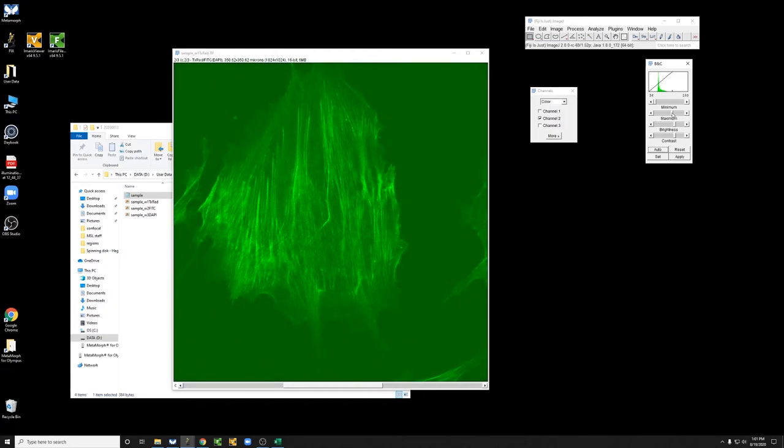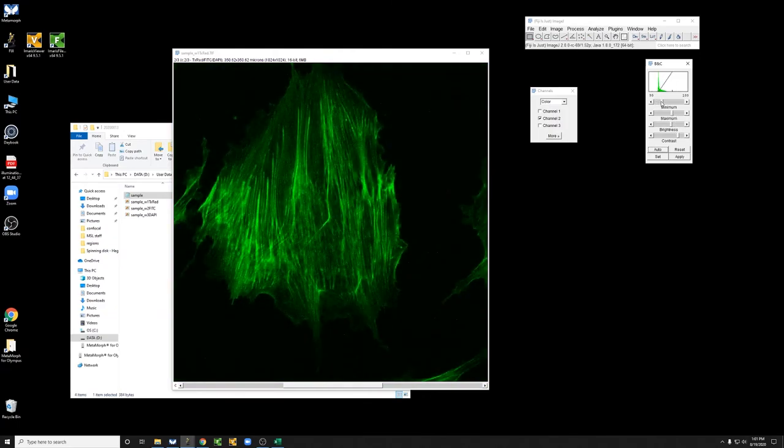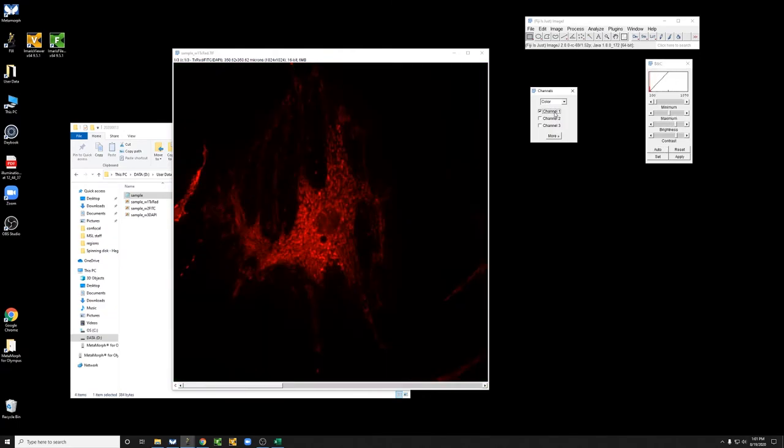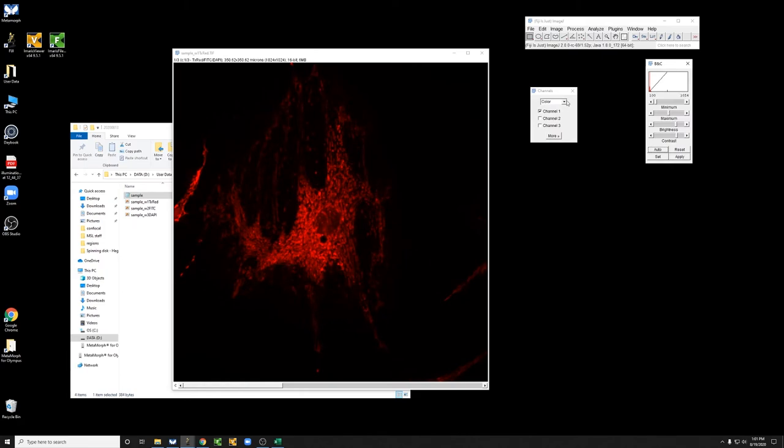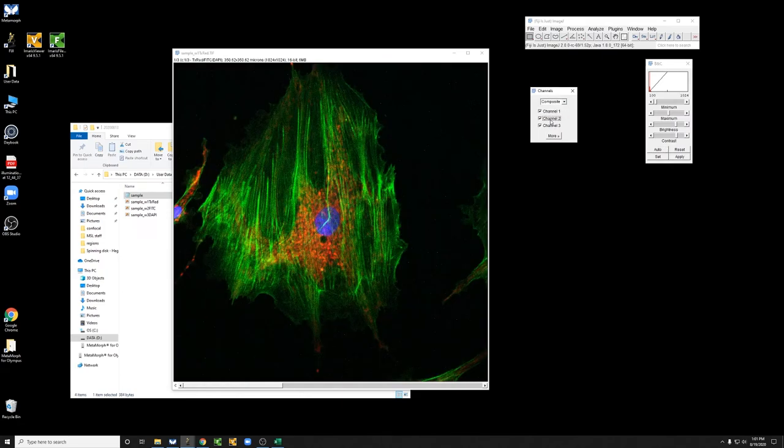do something similar for the green channel, and something similar for the red, and then we can look at a composite of all of them.